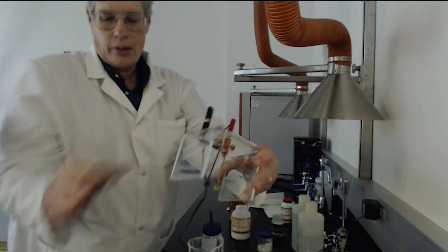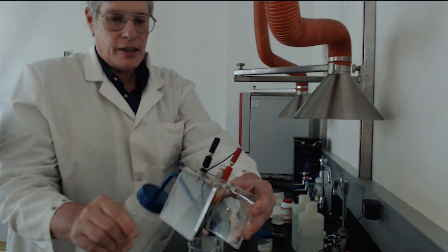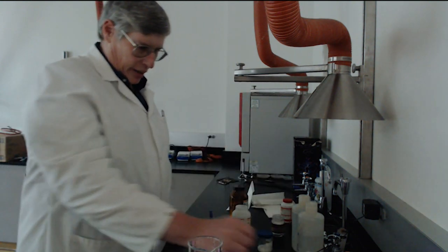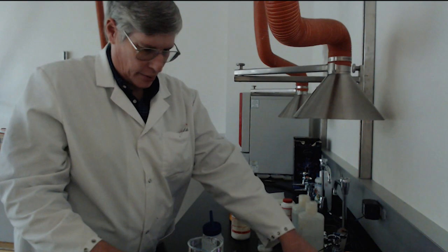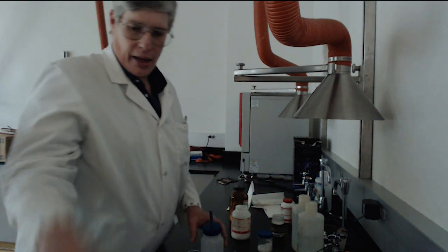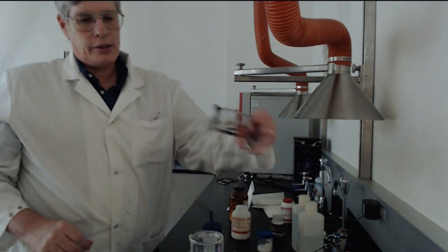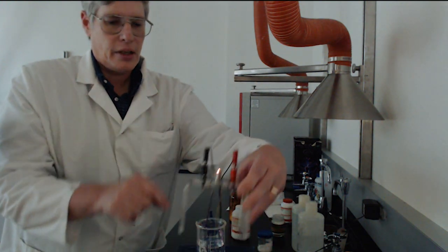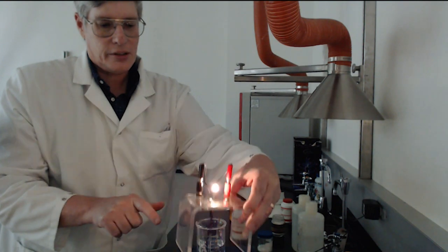And so an acid is classified as weak or strong. In today's lab, you are going to use hydrochloric acid as your standard for a strong acid. So what we're going to do, instead of using a light bulb, is measure the conductivity with an electrical probe to actually measure how fast electrons conduct.